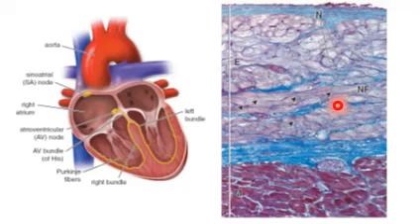We can observe the nerve fiber which belongs to the autonomic nervous system, and the intercalated discs appear much more clear, and the cells are larger in size and much lighter because of the presence of glycogen, which surrounds the extranuclear part of these cells. Do you have any questions regarding this issue?